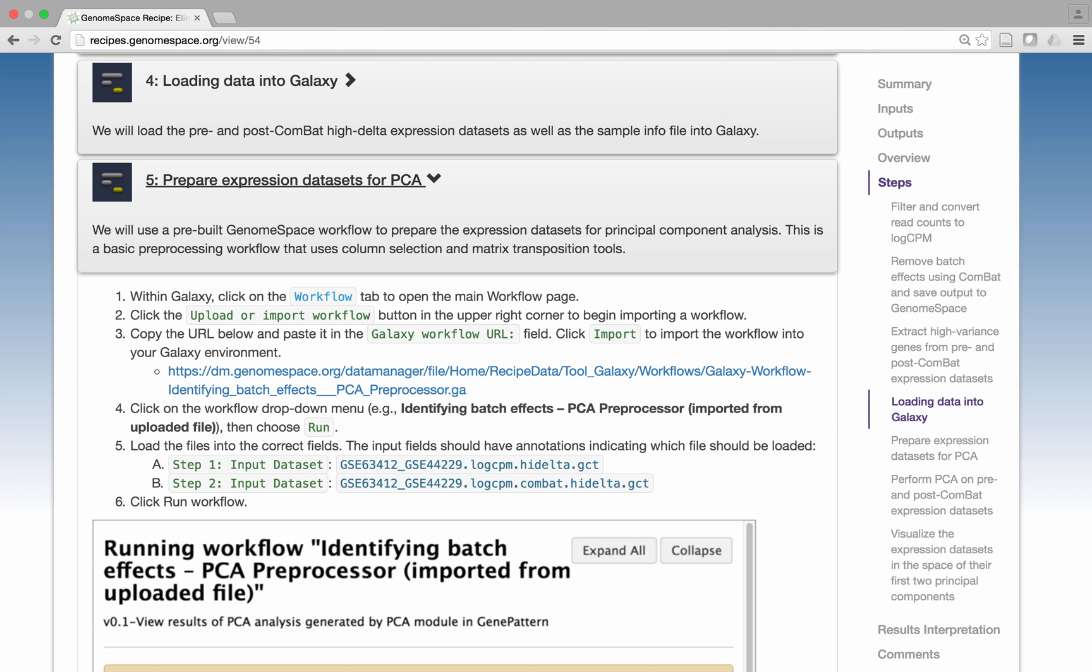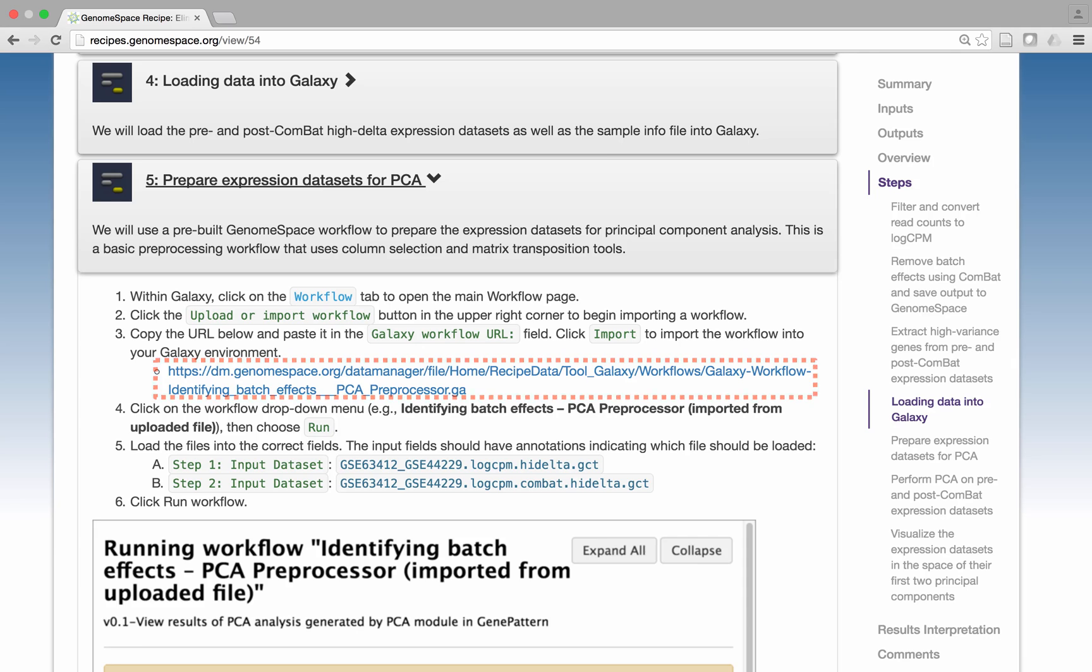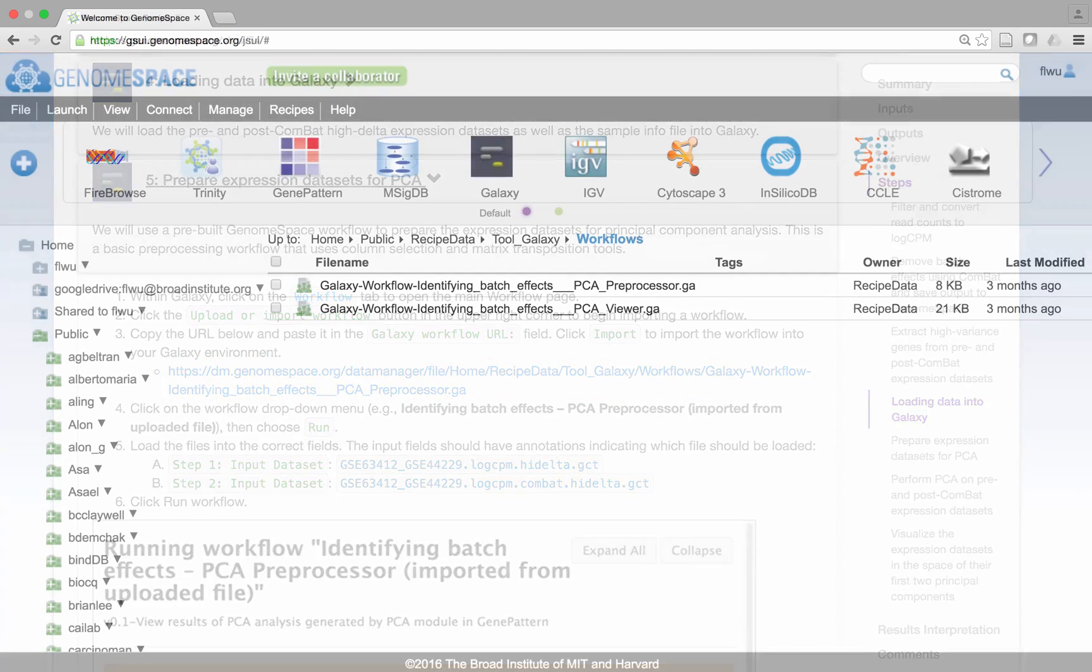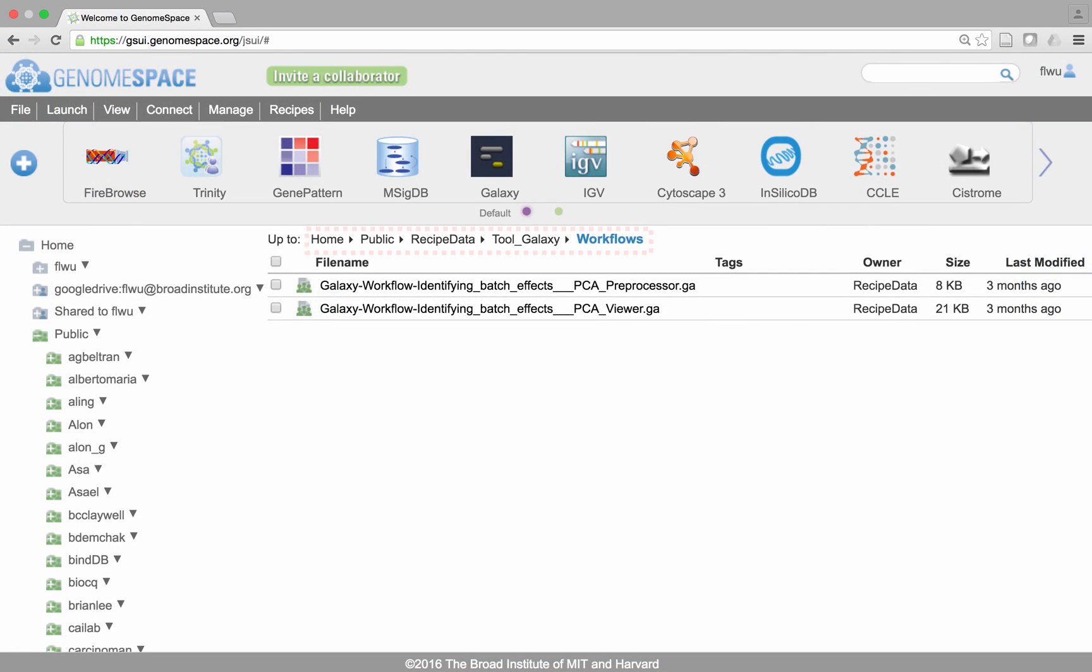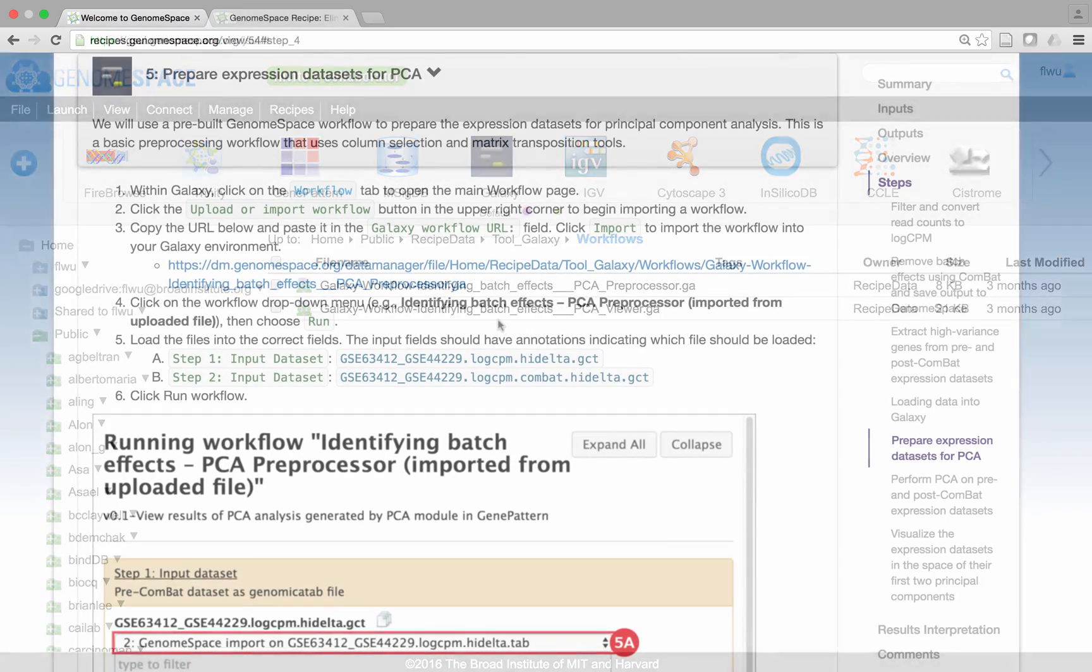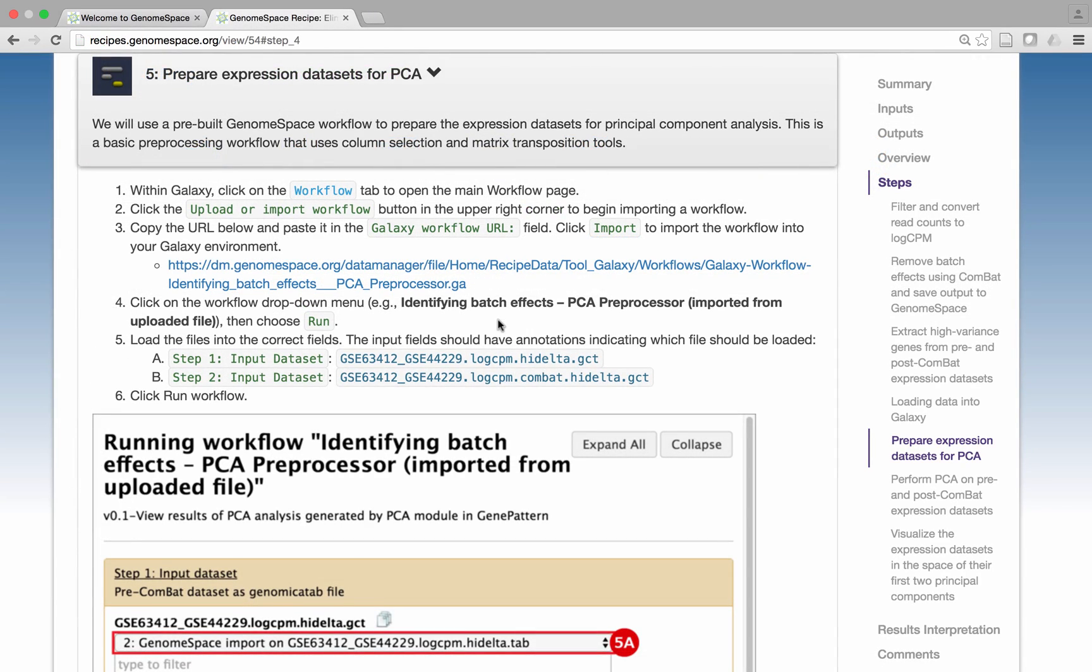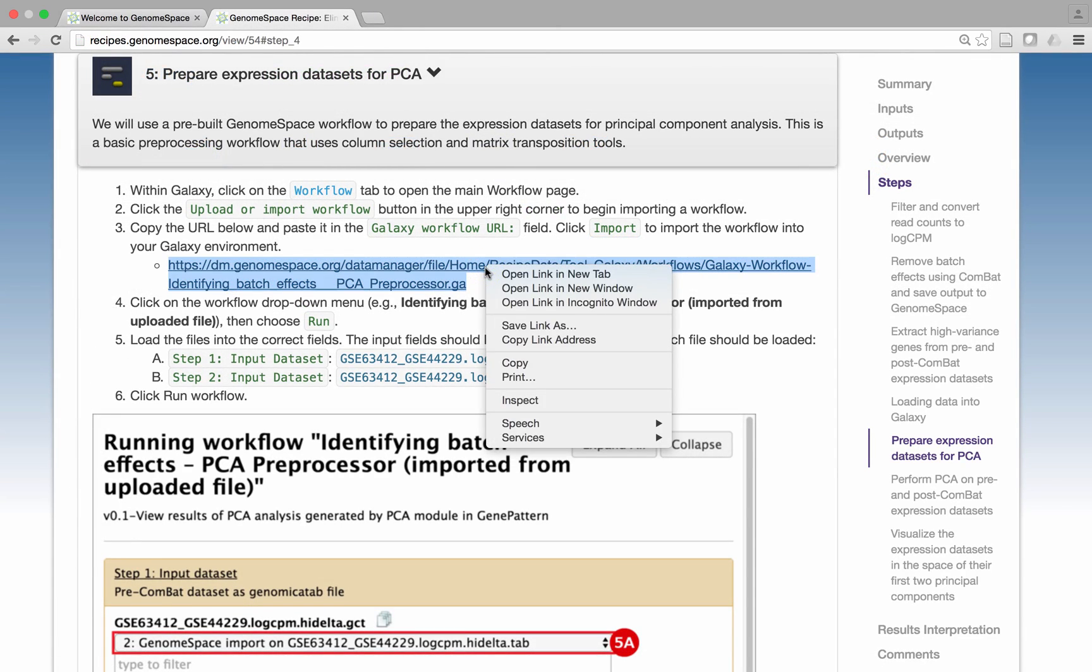Our GenomeSpace recipe pages contain links to the relevant Galaxy workflows, which are available in the Public Recipe Data folder. Right-click and select Copy to copy a Galaxy workflow link.